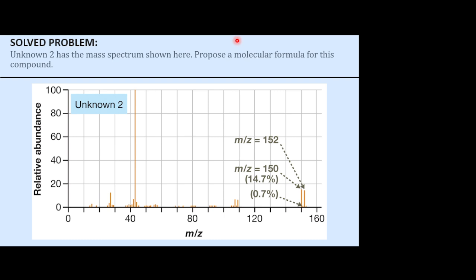Do we have anything special about this? Two peaks, so bromide. That's M. Yeah, we got an M plus 2, don't we? And so it's almost the same height. So very likely something like a bromide or a chloride, right?